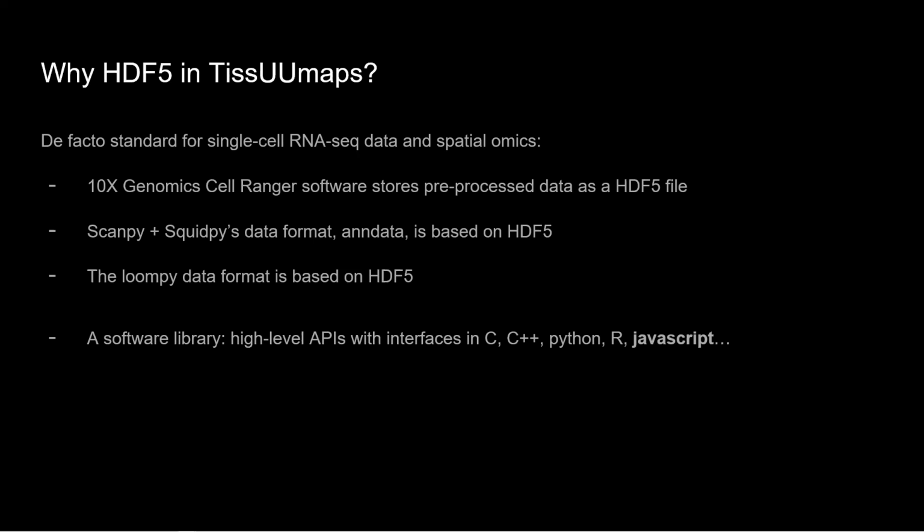It's also used in ScanPy, SquidPy, and all the scVerse libraries with AnnData. And the Loom format, also used in single-cell RNA-seq data, is based on HDF5 too. So once we can read HDF5, we can read many different formats based on it. Even MATLAB matrices are based on HDF5.